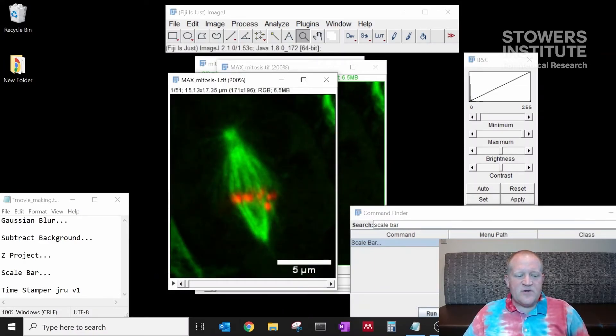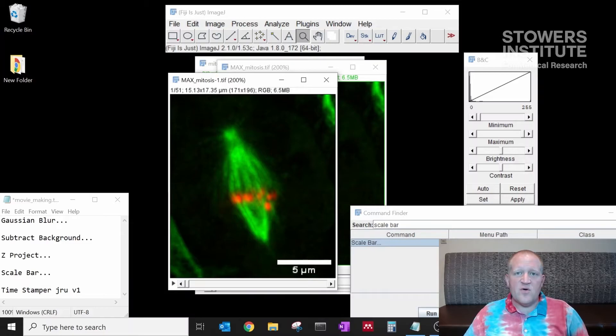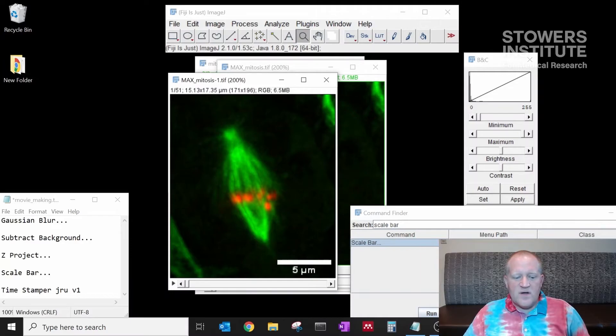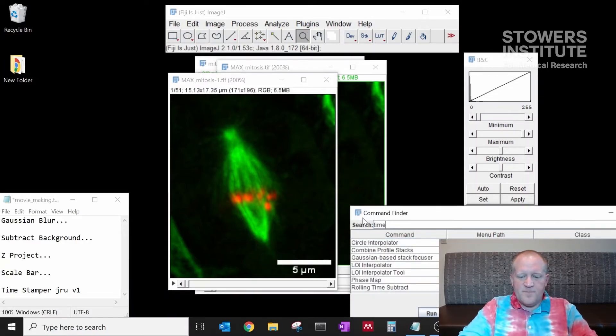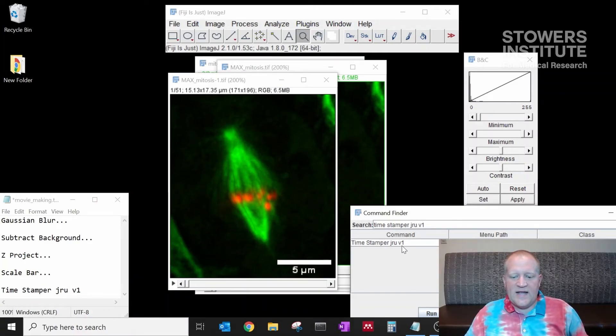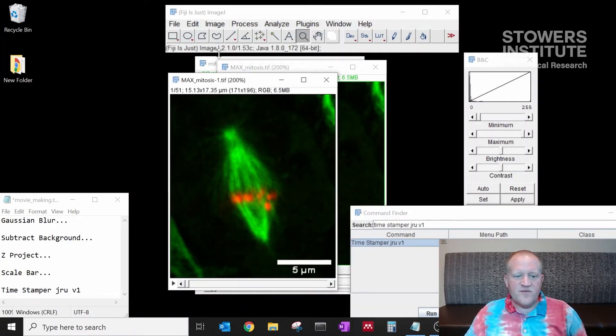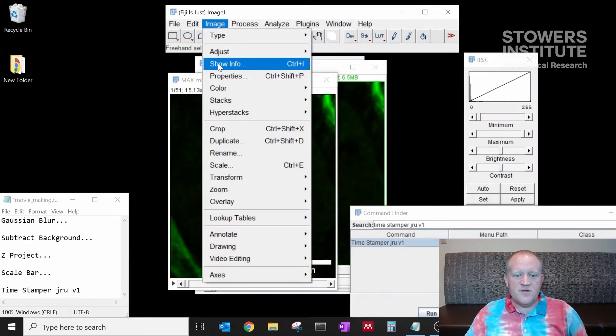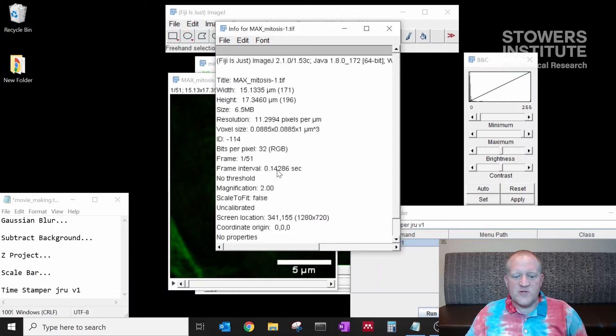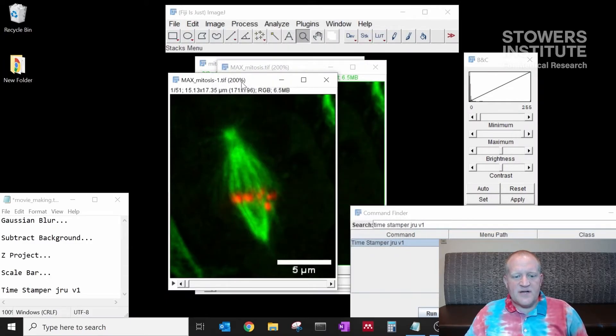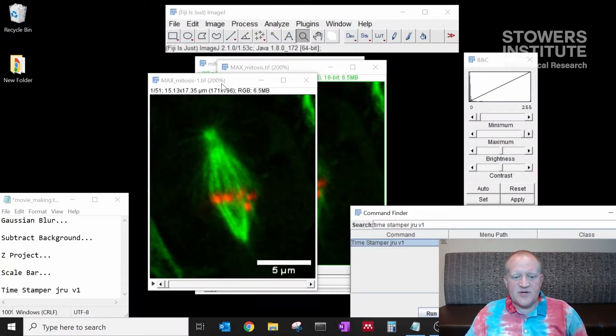The last thing I want to do is make sure I include the timestamp for this data set so that people know the time over which this process occurs. So we're going to look for timestamper jruv1. I know from image, show info, that the timescale per frame is 0.14 seconds. I'm going to select my data, make sure that timestamper is selected, and click run.